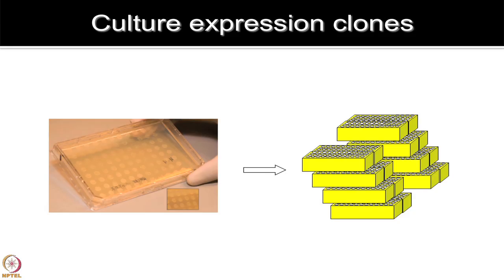Now, for the next couple of slides I will walk you through very fast, just keep looking at the images. These are just some illustrations. I am sure you have already done DNA purification work yourself, but in this case we are showing you in a more high throughput manner how you are doing everything in 96 well plate format or 384 well plate format, because you are talking about 10,000 to 20,000 genes of interest to be printed on the chip. So, you cannot do it in tubes. The whole setup is essentially meant for high throughput biomolecular sample preparation.